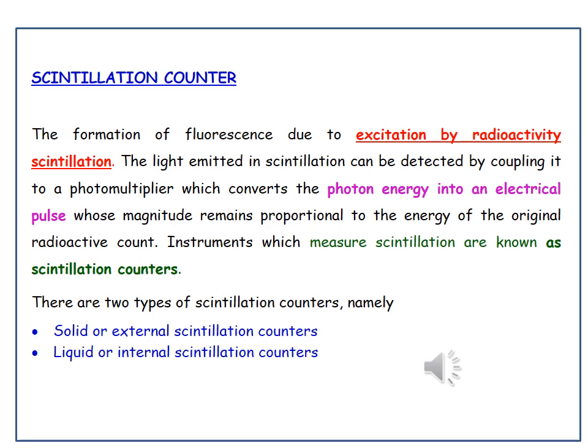There are two types of scintillation counters, namely solid or external scintillation counters.